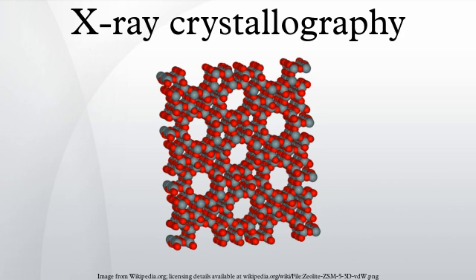Over 99% of these structures were determined by X-ray diffraction. Mineralogy and metallurgy. Since the 1920s, X-ray diffraction has been the principal method for determining the arrangement of atoms in minerals and metals. The application of X-ray crystallography to mineralogy began with the structure of garnet, which was determined in 1924 by Menzer. A systematic X-ray crystallographic study of the silicates was undertaken in the 1920s.